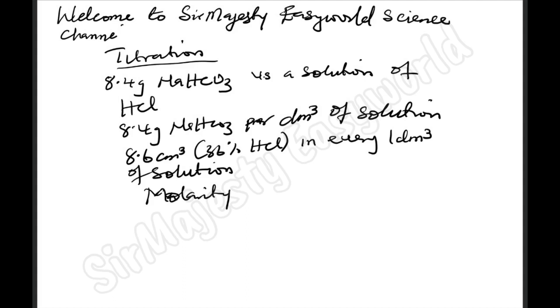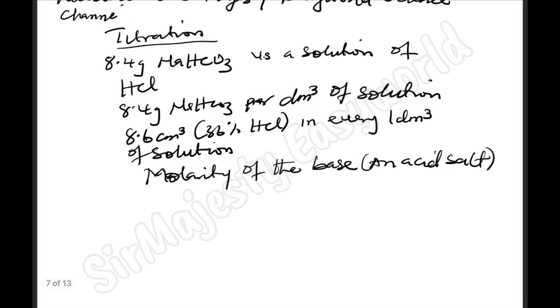So to find the molarity of the base, which is actually an acid salt, though, but is acting as a base here. Now, how do we do that?